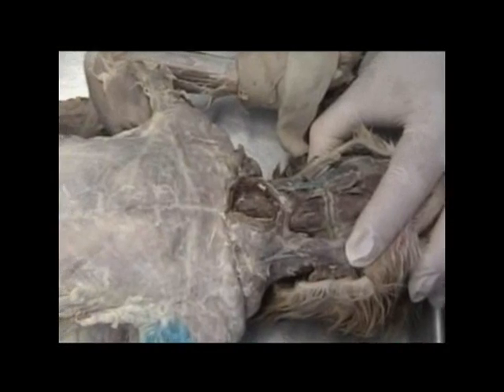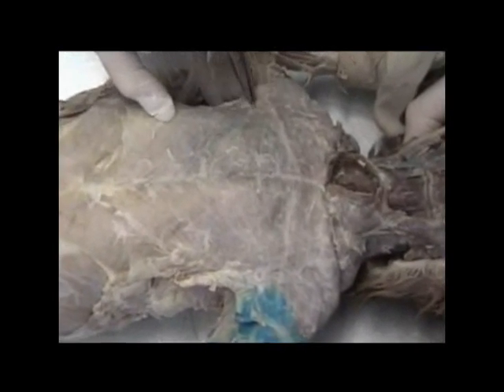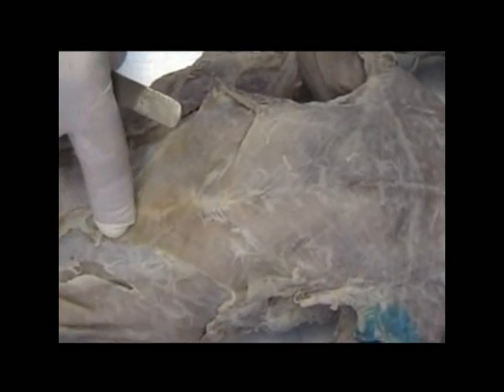In turn, if we start to work our way down to the superficial muscles of the chest, these aren't cut out here, but you can see the fascial lines that separate these muscles. And so working from inferior to superior, coming down, the xiphoid process would lie right underneath here. So you see a band of muscle running this way. This is the xiphihumeralis running from the xiphoid process to the humerus.